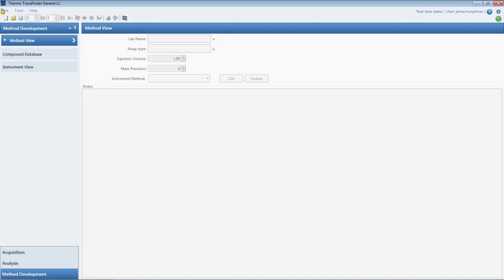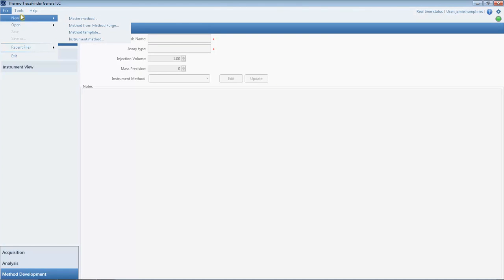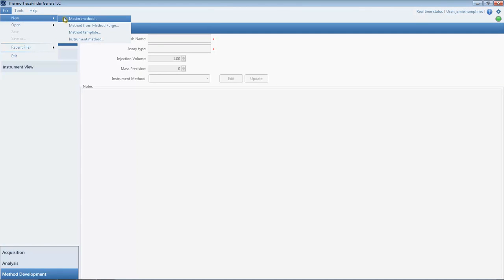Create a new master method from a template. We have several method-building shortcut options. We'll make this method from a compound database.